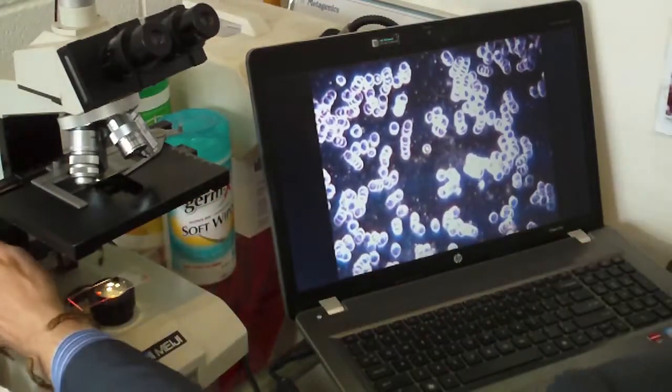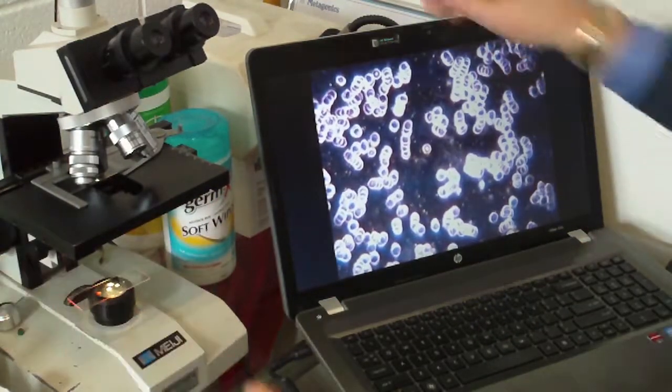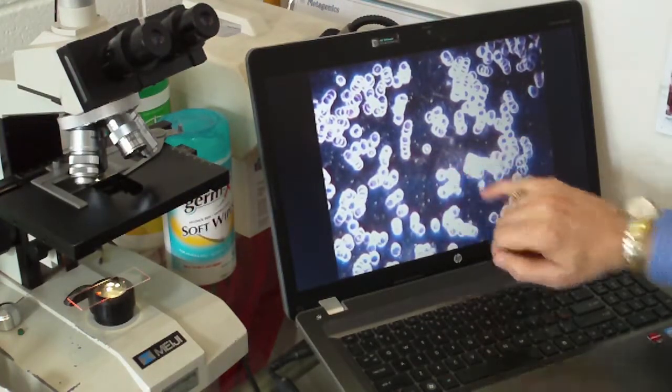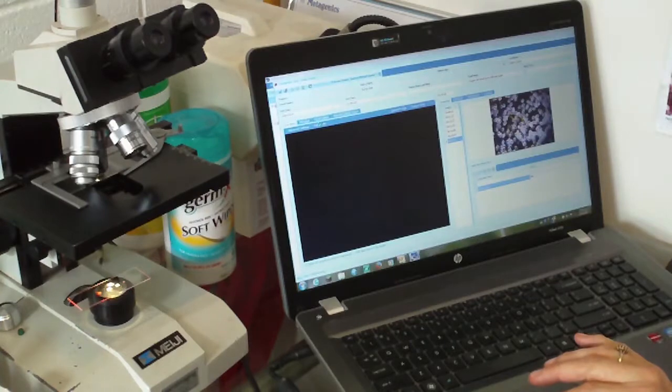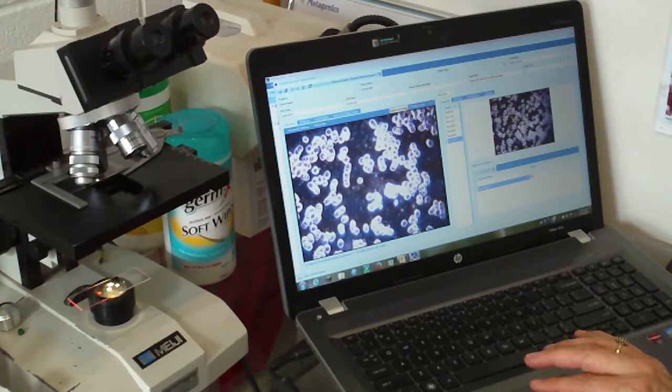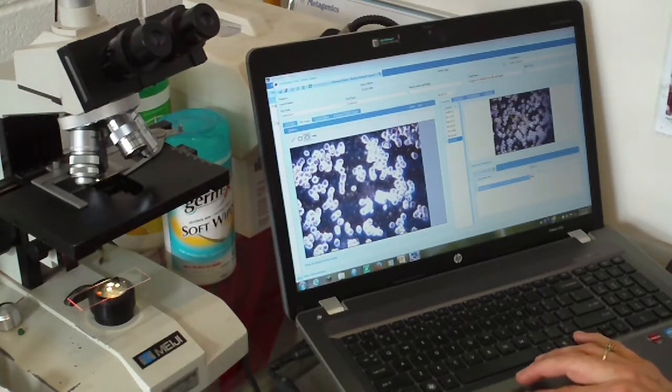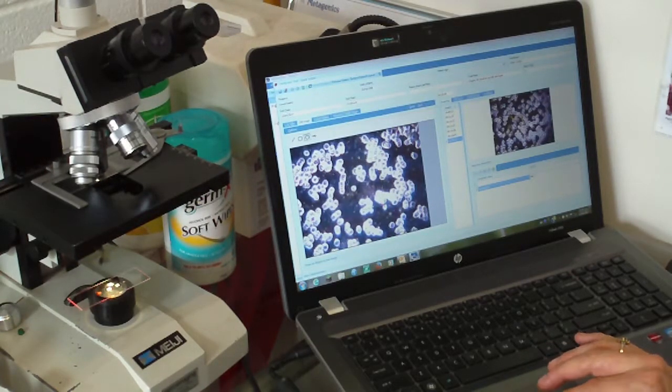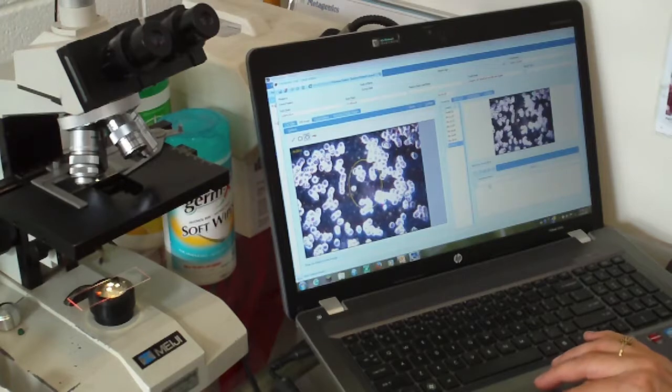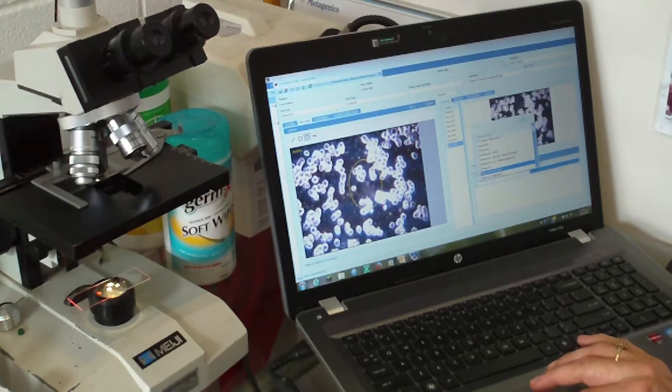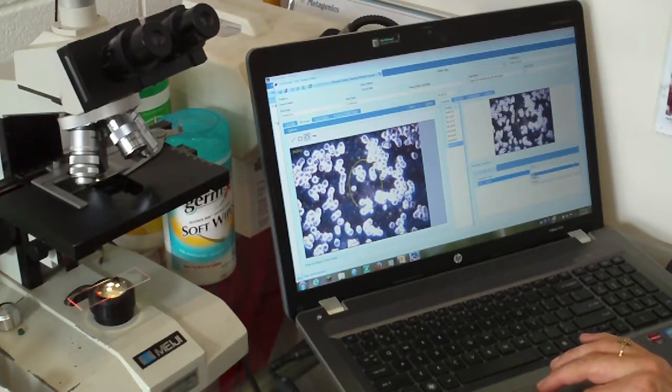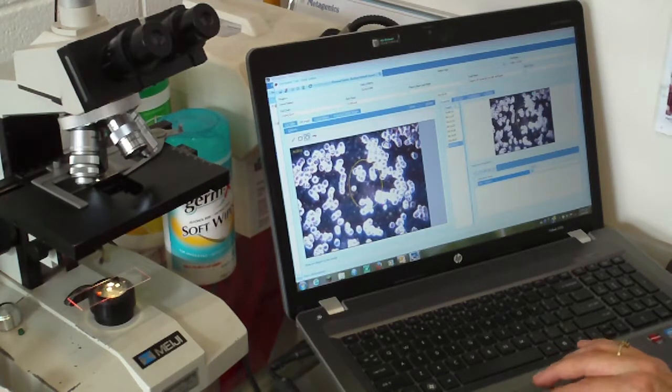Now, here we go. Here's an interesting sign. This is what it's all about. Often when you think you've seen it all, you suddenly pick up something else. You'll notice here this crisscross fibrous pattern. This is known as fibrin. Now, this particular patient's just started a detox in the last five days, and they're doing some liver repair work because of damage to the liver from chemicals that they were exposed to. And that sign there is a sign that the liver does need help, and it is detoxifying. So it's a very good sign. And it's known as fibrin, and it's a cluster, and it's of the mild parameter. So very useful.